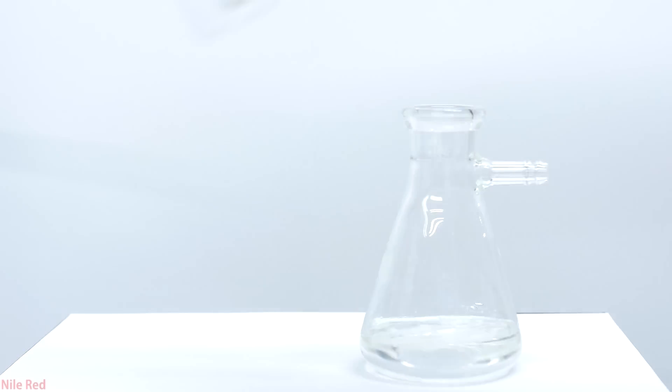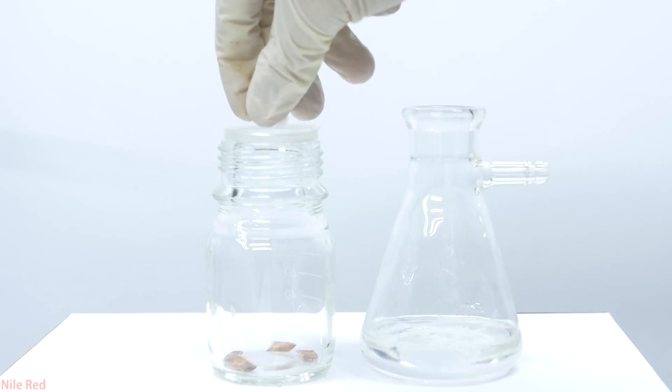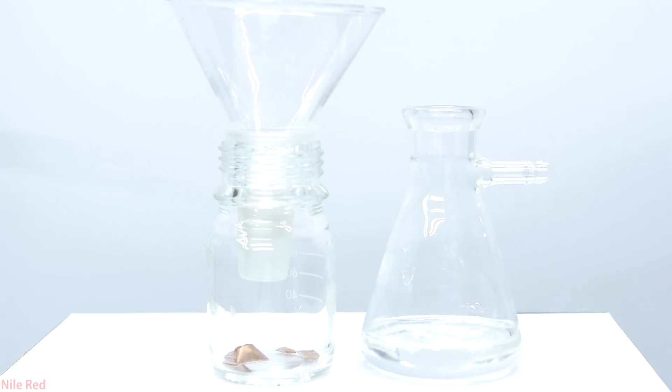After letting it sit for a few minutes, we're ready to put our methyl iodide into storage. To store it, I put it into a nice Pyrex jar with some freshly polished copper at the bottom. It's really hard to see here, but the funnel that I'm using has a little bit of cotton in it to filter out the calcium chloride.